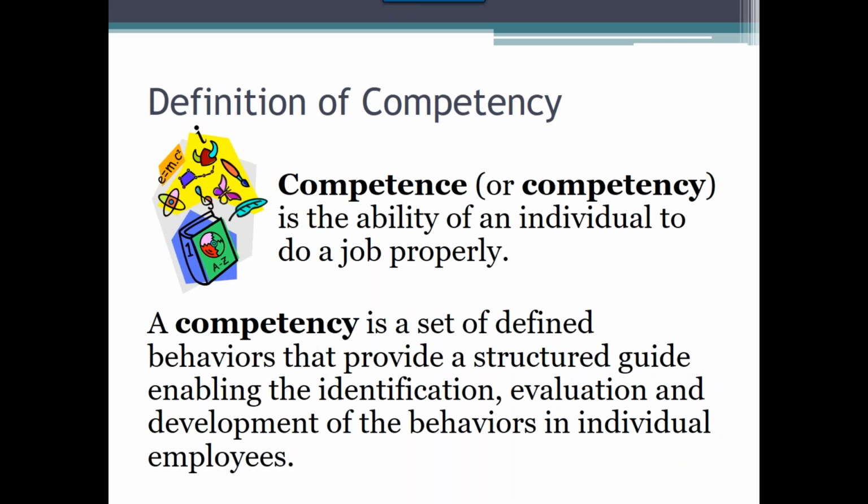Competency is different from training, and it's really important to understand what the difference is. Competency is described as a set of defined behaviors that provide a structured guide enabling the identification, evaluation, and development of the behaviors in individual employees. Competency is critical because it ensures that the employee has been trained appropriately and that they understood the training that they were given.